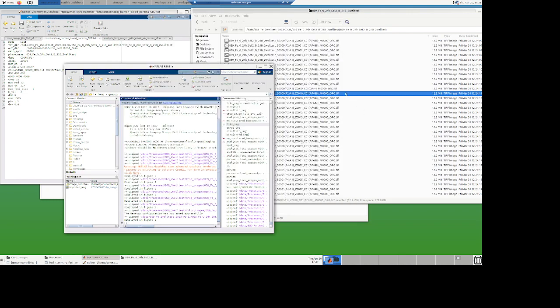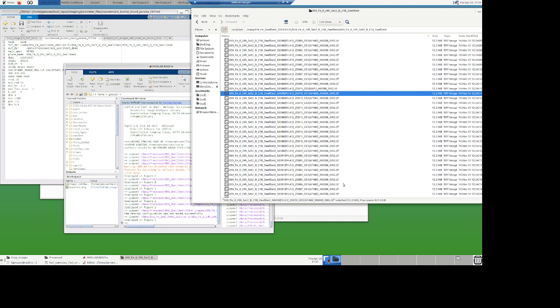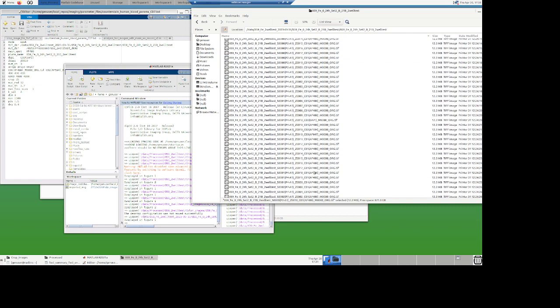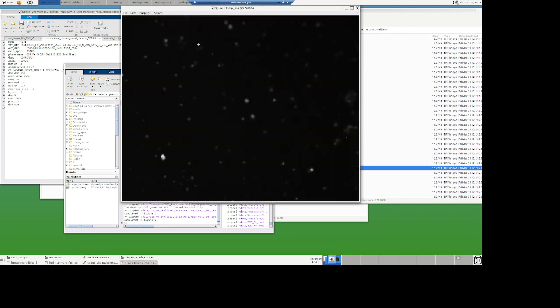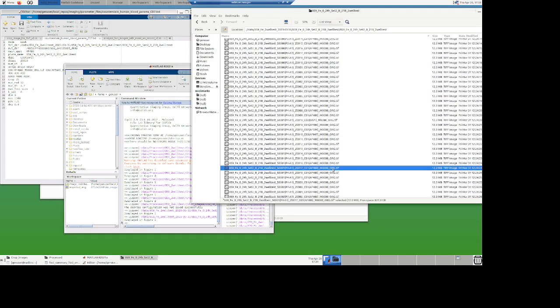Now, what would be practical is to actually look at something that has a spot. So I could try to read another one, let's say this one here, which is another position. Linear again. Yeah, it's not focused. Hold on. It slices at 17. Okay.